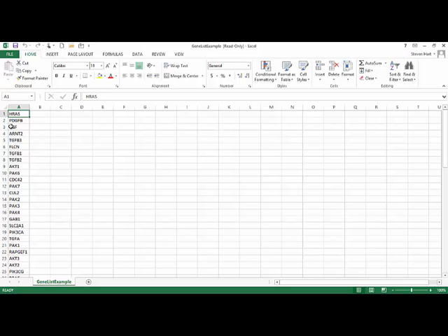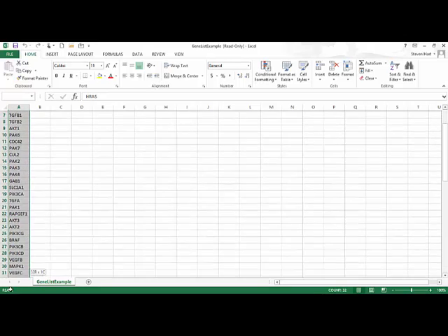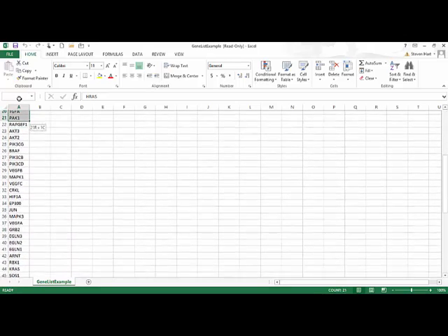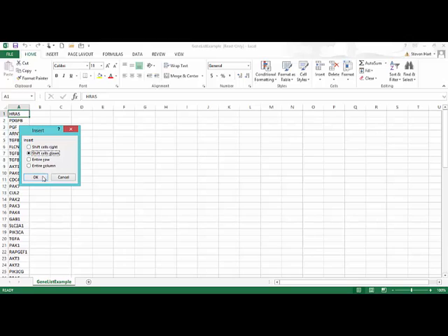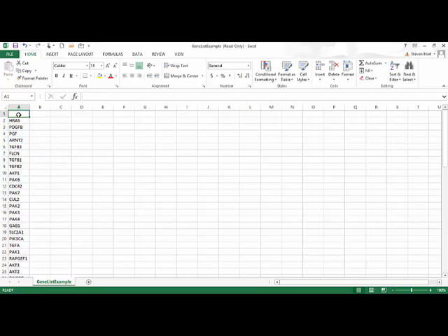Mine is set up to where it reads in Excel. And what you can see here is this is just a list of genes. It doesn't really matter what they are. Obviously, you would have one that is important for your experimental design. What I'm going to do is I'm actually going to create the input file, and this is all I have to do. In that first cell, I have to say that it's hashtag gene, and that's all I need. Optionally, I can put in other descriptions.